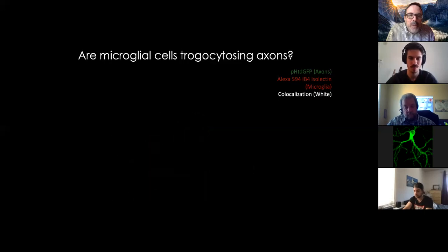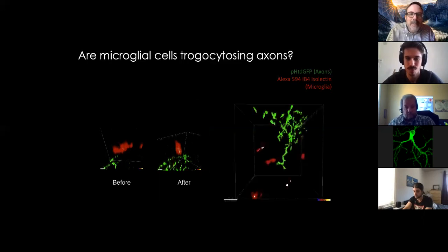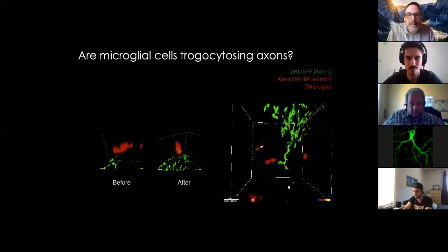And I don't know if you saw it, but in this case, the microglia starts off with a low level of green fluorescence associated with it. Some of that is autofluorescence, but after interacting with the axon, it actually has a higher level. It's maybe even clearer in this case.